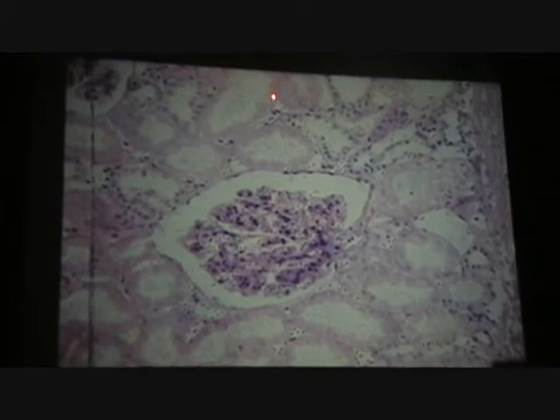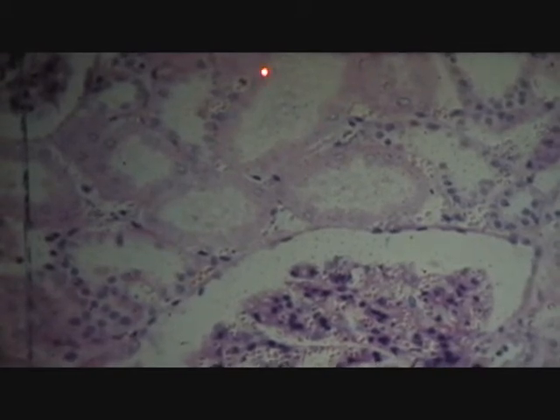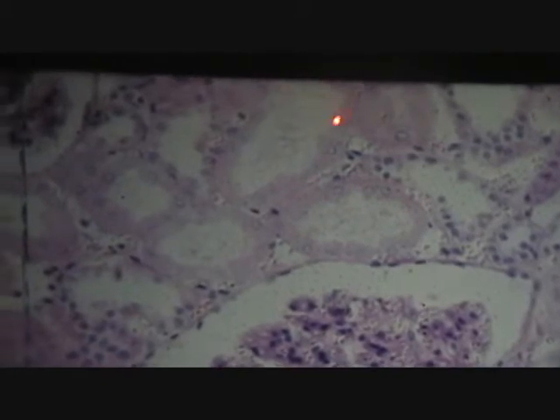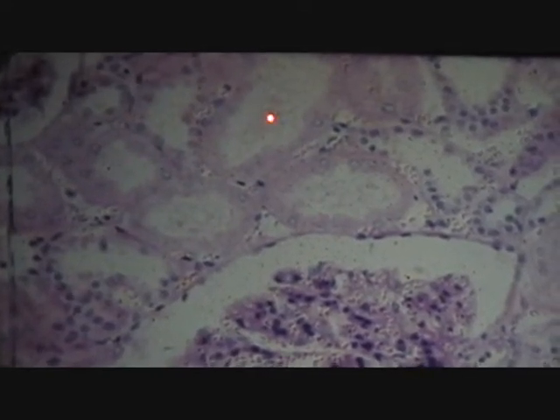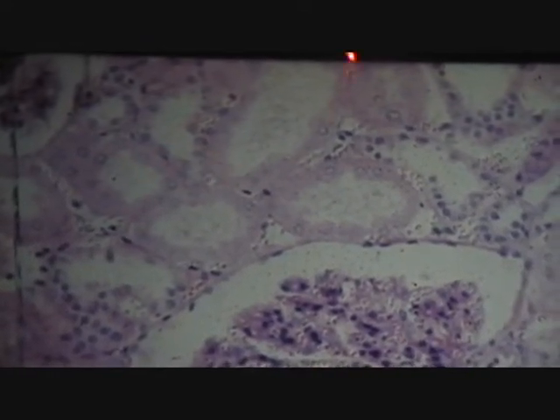And for us with a PT, all you're going for is something like this compared to this. Nice thick cuboidal cells in the wall, much thinner cuboidal cells in this wall. 30, 35% thinner. Nice tight oval lumen, more elongated or oval for the lumen. So those are the 2 criteria you're using to tell a PT from a DT. So this one, PT, and then this, DT.